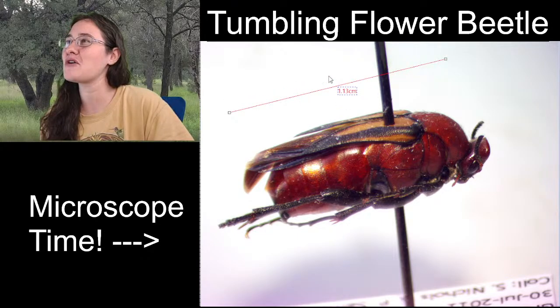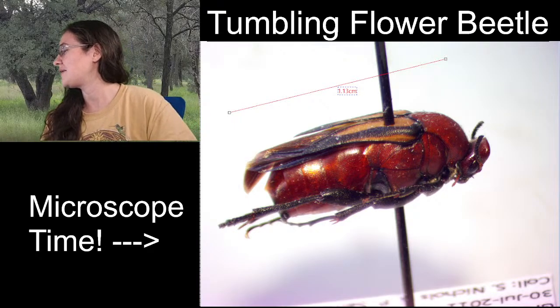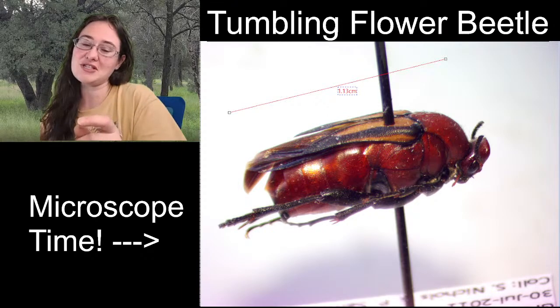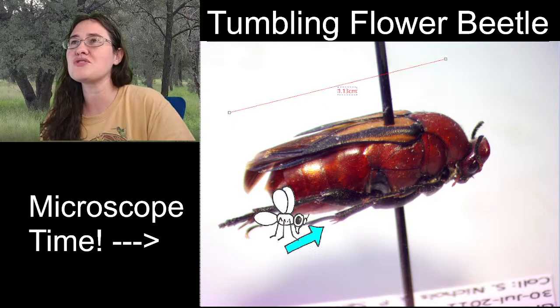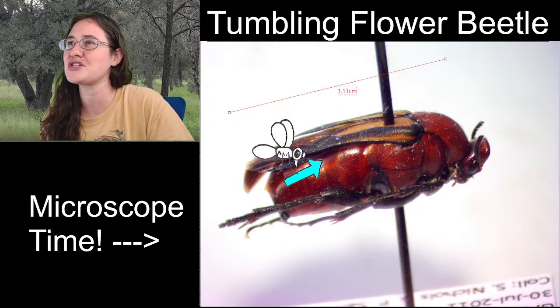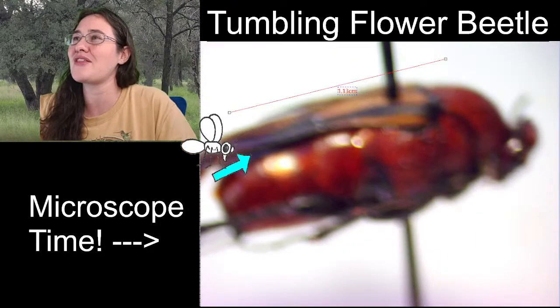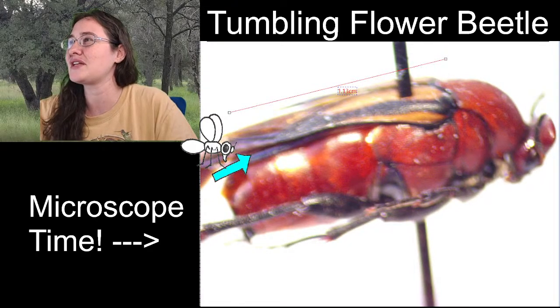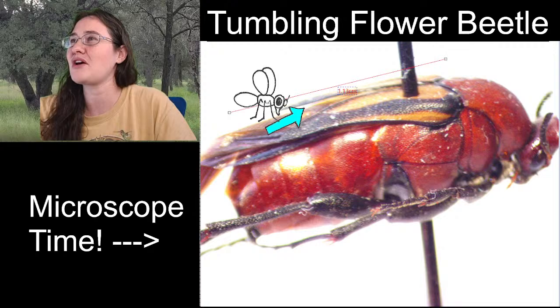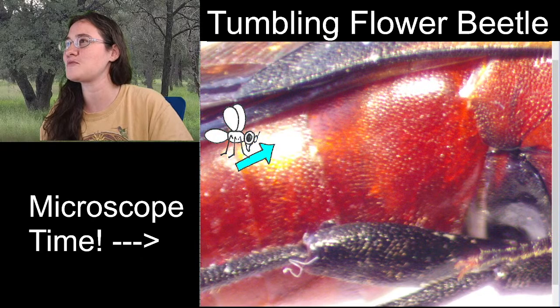The tumbling flower beetle is 1.13 centimeters long. So it's a good sized beetle, but it's not huge. You can see the size of the pin in relation to the beetle. You can also see from this angle the edges of the elytra pretty well. You'll notice that the first pair of wings, those elytra, actually end in a point right here. Let's see if we can grab it in focus. There we go. Right about here, you can see the end of the elytra, just in this point right there.